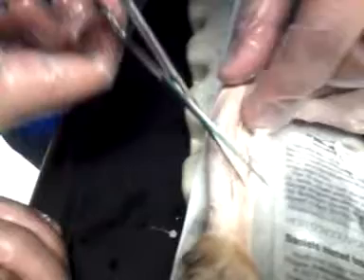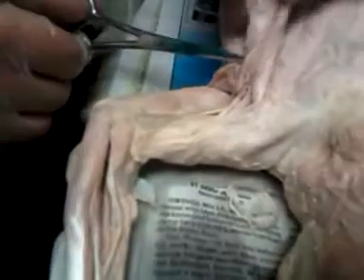I can't do that. I got it. Zoom in on this. Yeah, I think that's the tendon right there. Ew, you broke it. That's a tendon right there. The silver stuff is a connective tissue. You think this is muscle or this is definitely connective tissue?